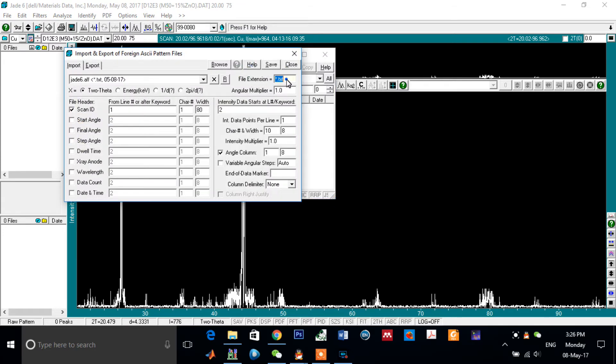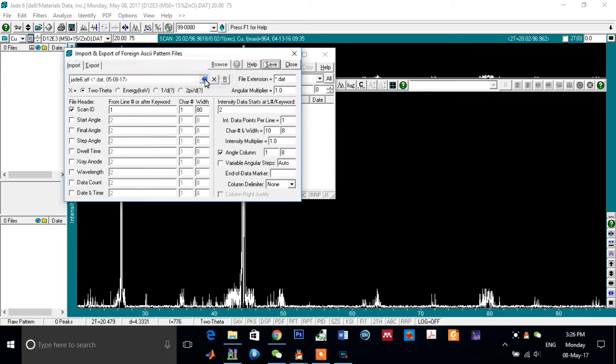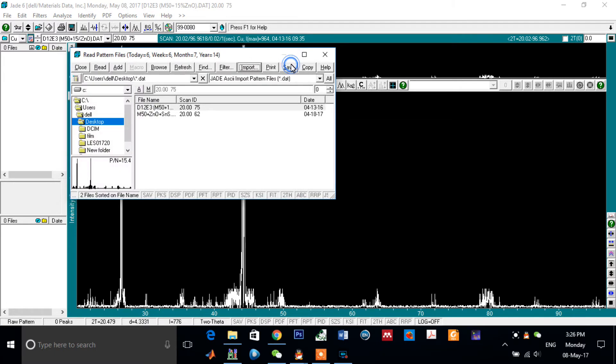From the file extension, change it from text to data file. Remove text and type data. Save it, click on OK, close it.